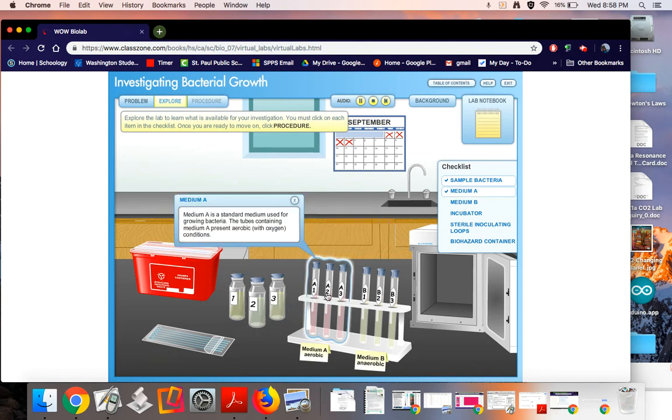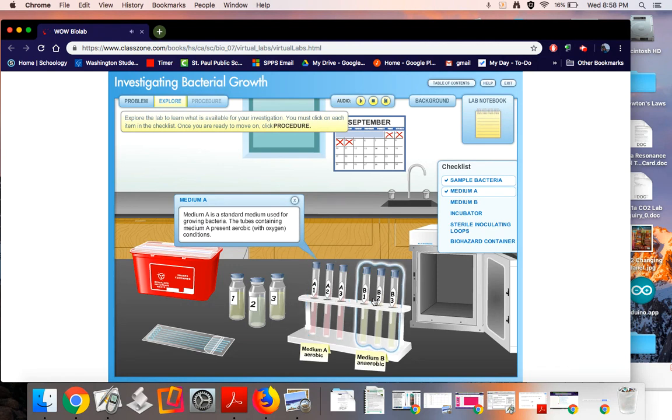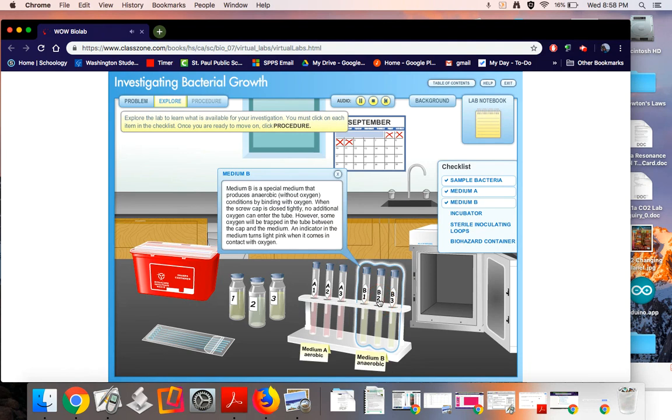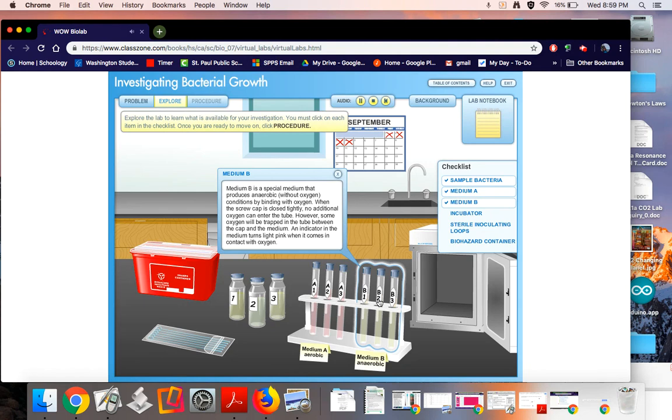Let's see what else I've got going on. Medium A is a standard medium used for growing bacteria. The tubes containing medium A present aerobic, with oxygen, conditions. Medium B is a special medium that produces anaerobic, without oxygen, conditions by binding with oxygen. When the screw cap is closed tightly, no additional oxygen can enter the tube. However, some oxygen will be trapped in the tube between the cap and the medium. An indicator in the medium turns light pink when it comes in contact with oxygen.